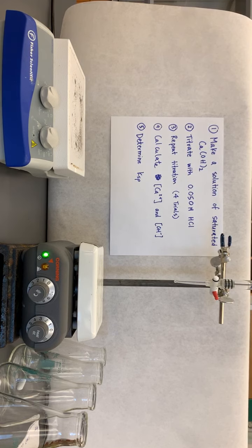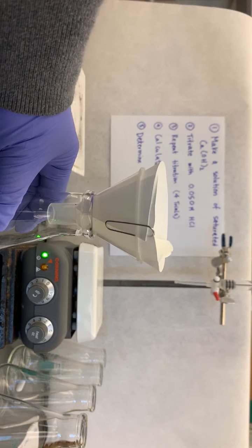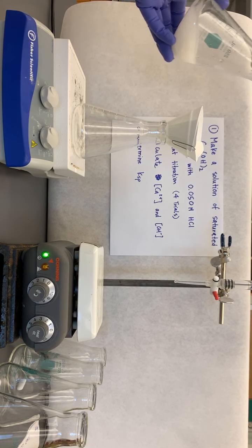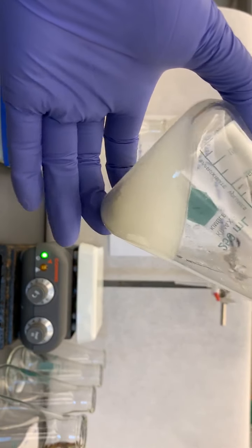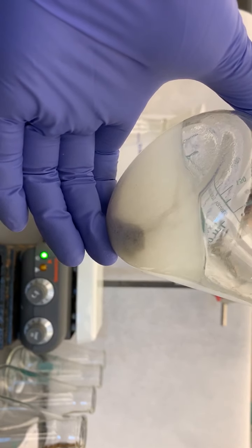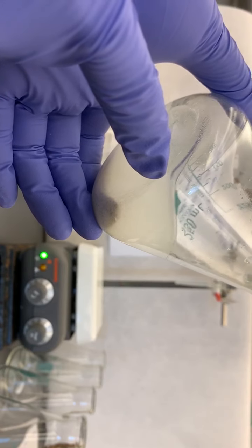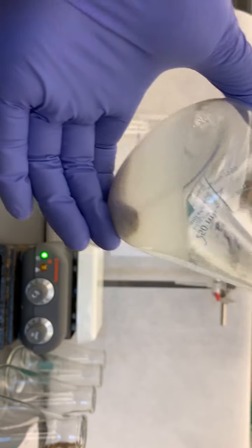What I've got here is a funnel with a filter paper inside of it, paper clipped in so it doesn't slip. I'm going to pour the solution that I made, and filter out any solid. You can see already at the bottom there's a little bit of solid that hasn't dissolved. That is a sign that I have a saturated solution, because not all of it has dissolved. So really what is inside here, the liquid, is the saturated solution, and inside here is Ca2+ and hydroxide OH-.